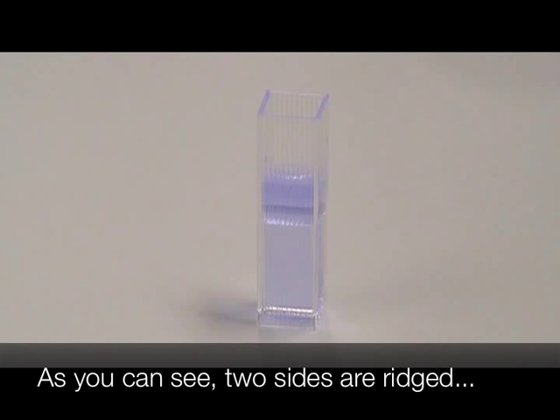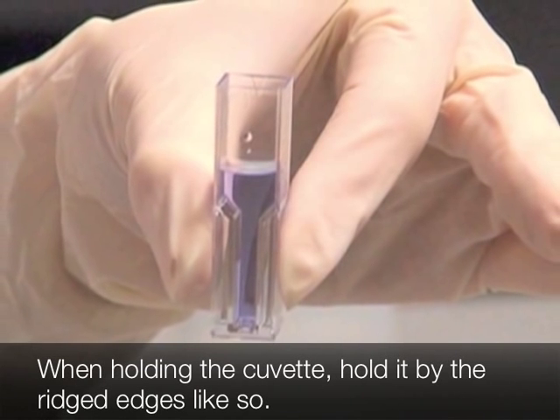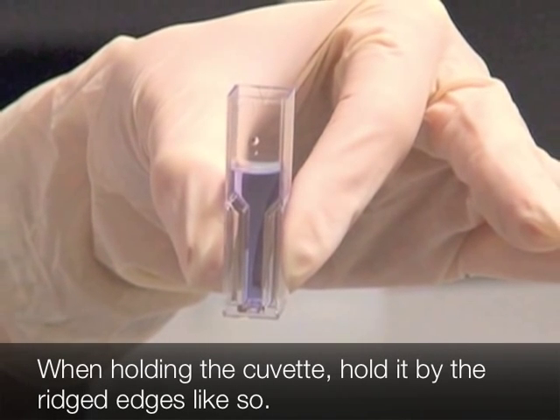As you can see, two sides of the cuvette are ridged and two sides are smooth. When holding the cuvette, hold it by the ridged edges like so.